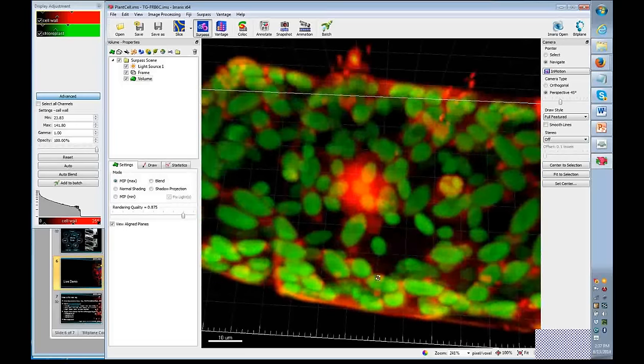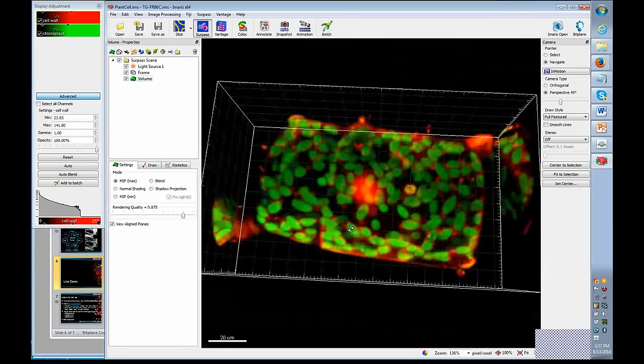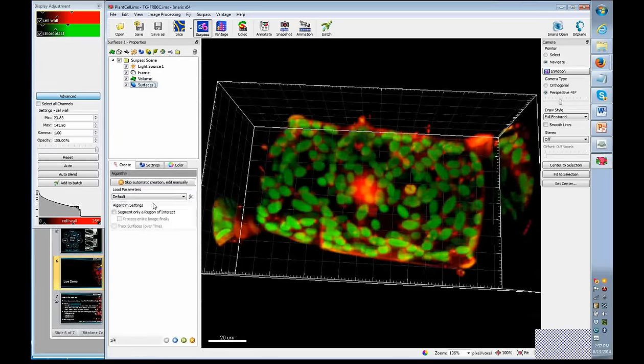And it could be difficult to get the right information out of these chloroplasts in this case, detecting them as spots, because the sphere would fill part of the object rather than the whole thing. If we needed the intensity information, for instance, we would have to go to the surfaces object. And again, we get a wizard here.